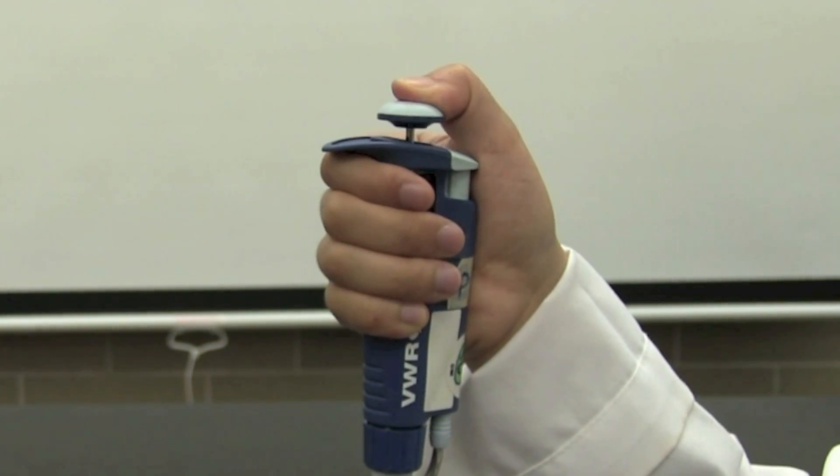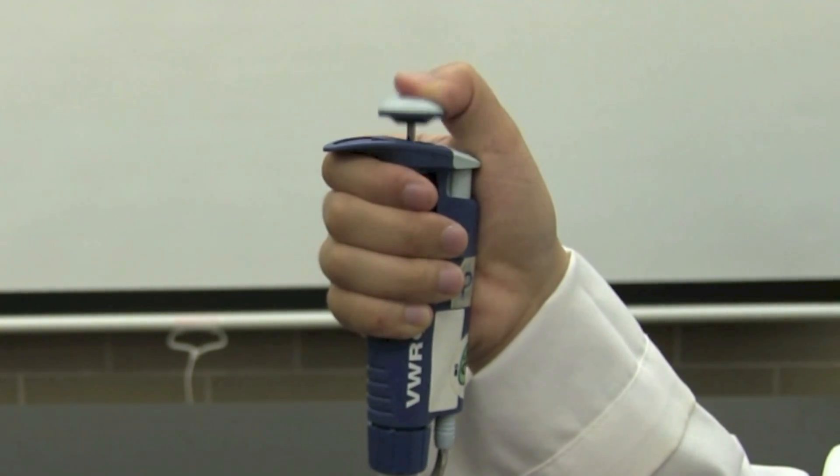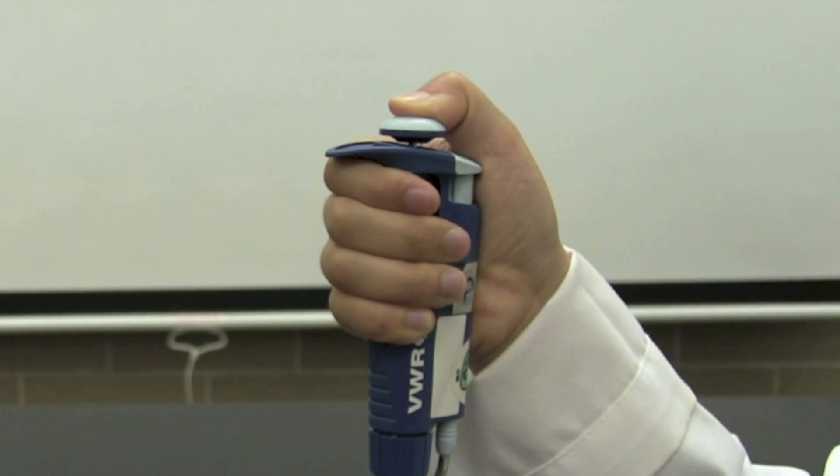Lastly, push the plunger button. You will notice that there are two stops. The first stop releases the volume that you have calibrated. The second stop is only used to expel leftover fluid stuck in the tip.